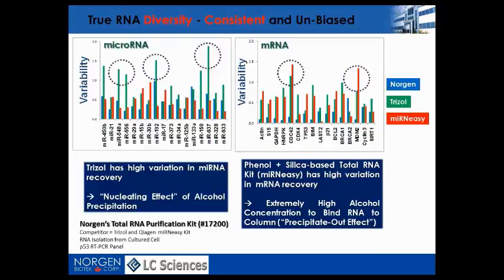For purifying RNA and DNA, we are using methods that have been developed for quite a while. Phenol-based, for example, which is very common. Secondly, column-based, using silica membrane. These methods have served very well, particularly for sample input that they were originally designed for, such as cells or tissue with high RNA amounts. As a natural transition, people have started to fit these types of extraction methods to isolate RNA from liquid biopsies, such as plasma, serum, urine, or even exosomes.